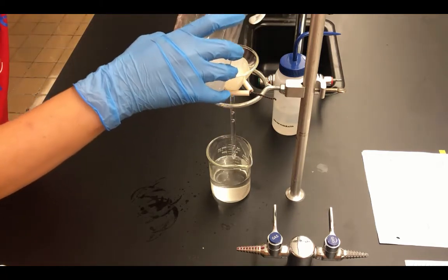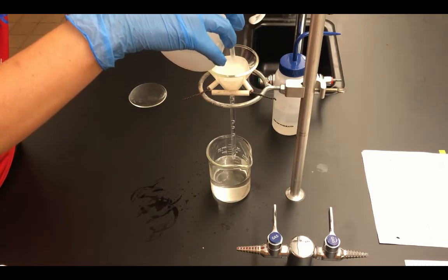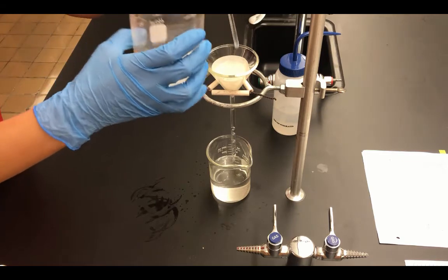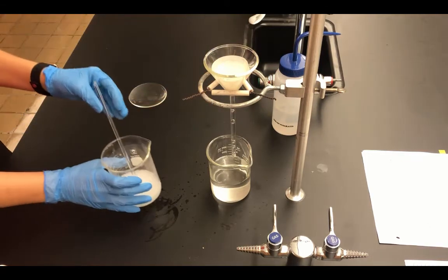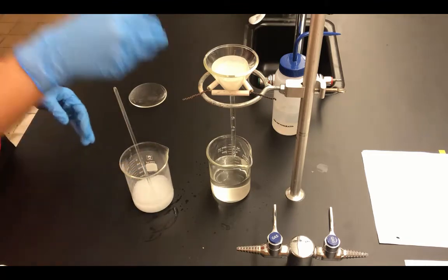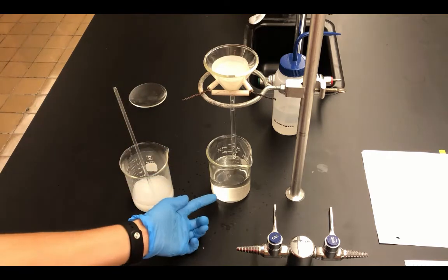That way, as you're filtering, you can be sure that you're actually pouring some of the solid out with the filtrate as well. So as you get closer and closer to the bottom, just keep stirring right before you filter.